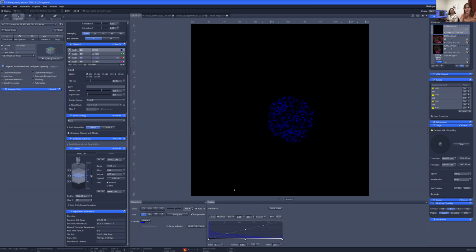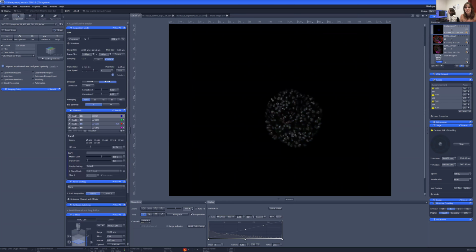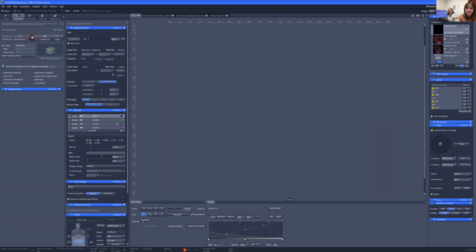So yeah, let's see what we do. And keep your questions. There will be points when Mikala's talking more about what she's doing so she can narrate, and then we'll have periods of a break where she's concentrating on figuring stuff out, and then I can help relay questions. And Jess, you can also ask me what am I doing right now. I'm like the MC of this event. Yeah. Okay.